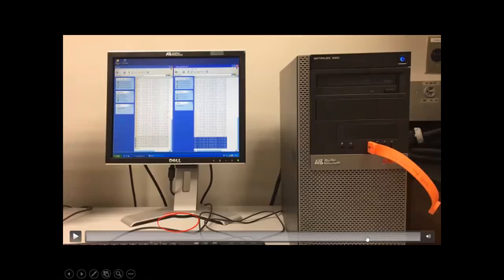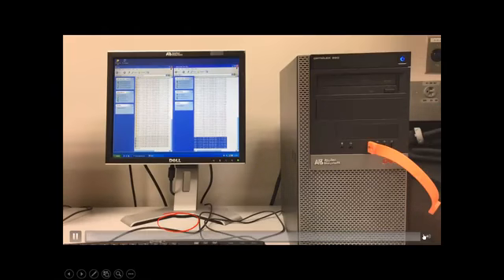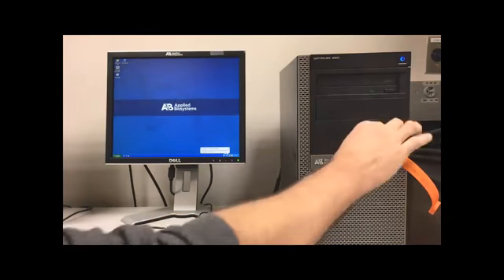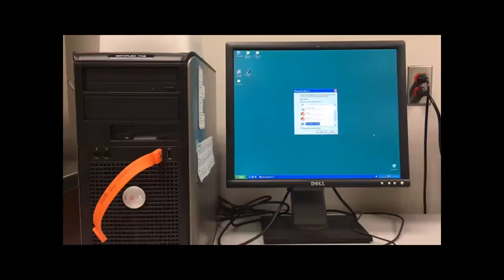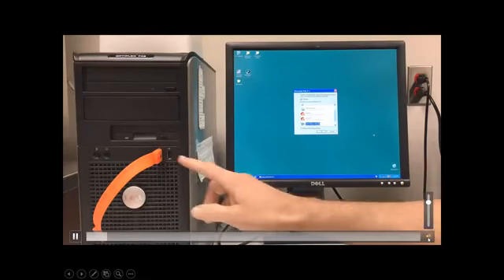Okay, so now we have our copies. We just need to take out the USB drive and close everything out. Oh yeah, that's right. Go down to the little icon there and eject the USB drive, and then it's safe to pull it out. I don't think anything's going to catch on fire if you don't eject the USB drive, but it never hurts.